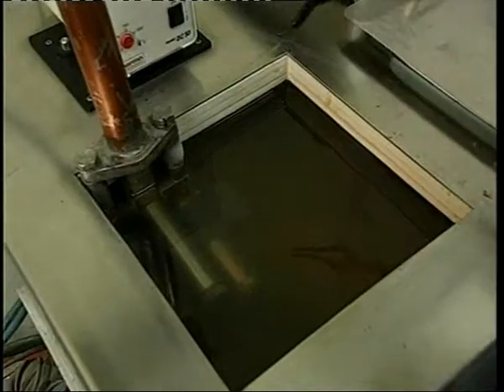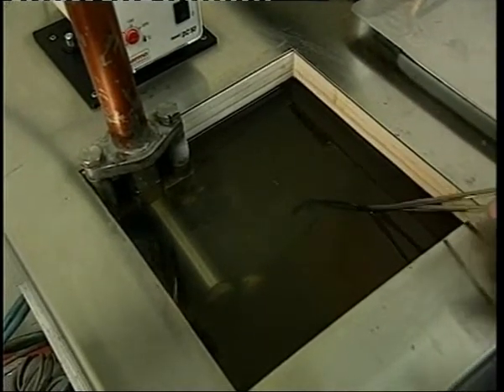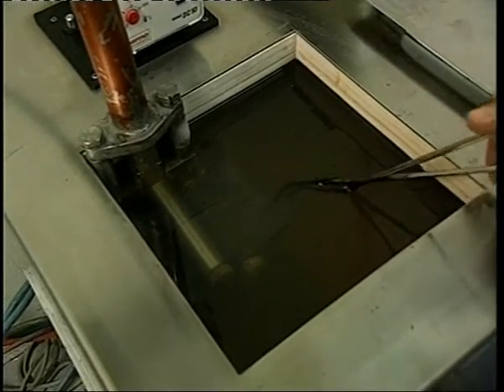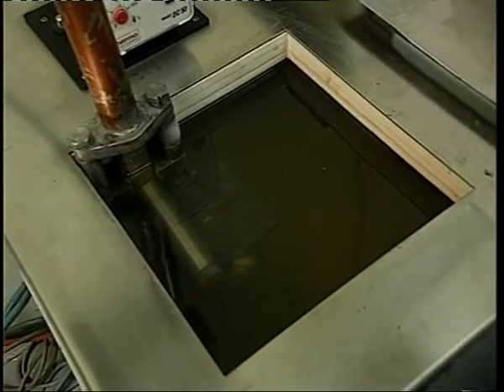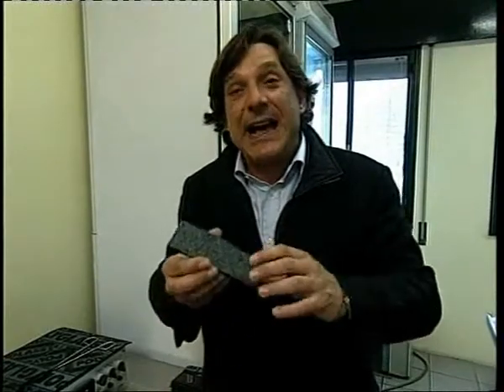After this conditioning, the requisite 2 hours serve to guarantee that every molecule in the product has the same temperature. The sample is folded in half by 180 degrees for 30 seconds and placed beneath a spindle of 30 mm diameter. If this spindle does not puncture the upper part of the membrane, it passes the cold flexibility test. This test is very important because it indicates the quality, the quantity and the capacity of the product to be bent at low temperatures.